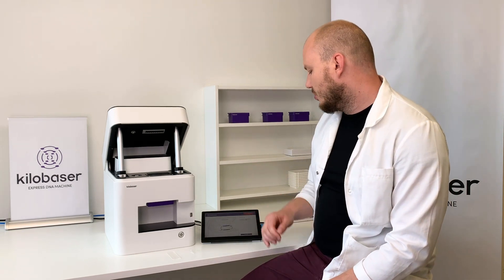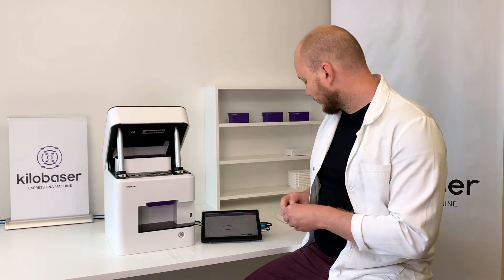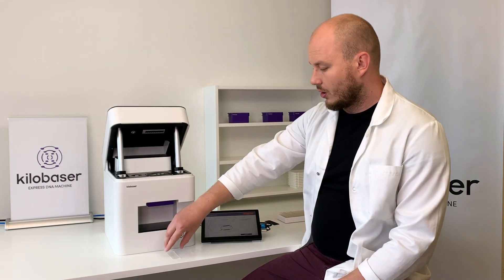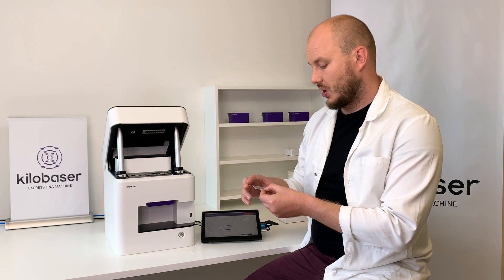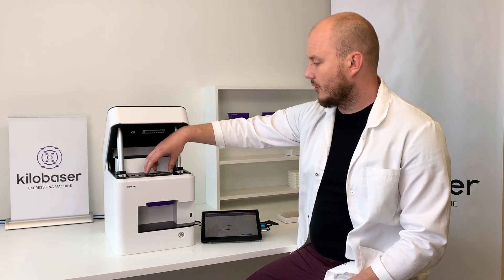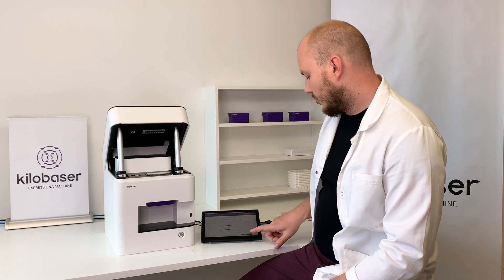Once the lid is opened, it tells you to remove the placeholder and insert the chip. So I remove the black placeholder. This is the microfluidic chip we developed. We put this chip into the machine and press confirm.